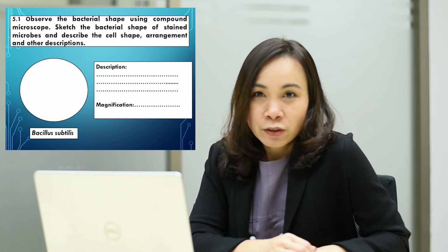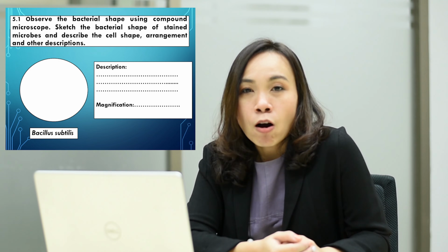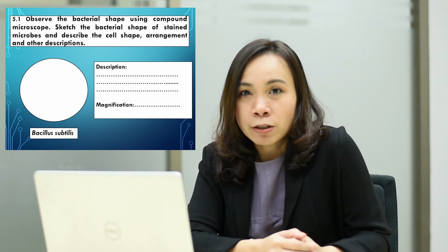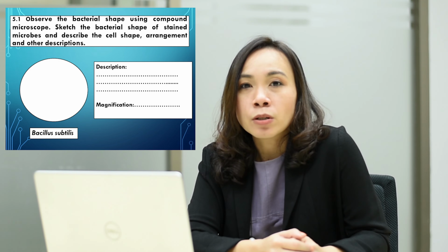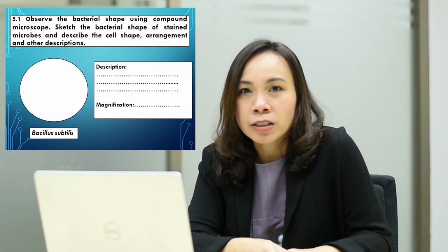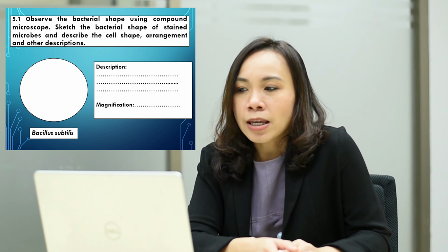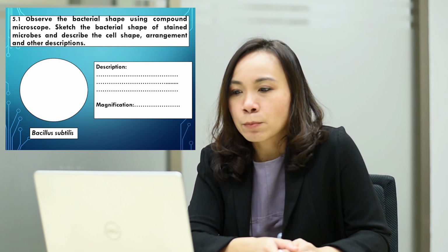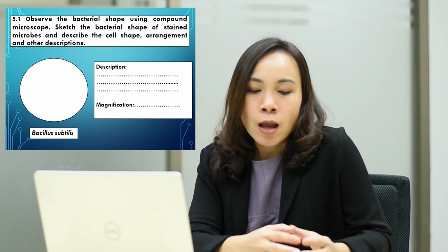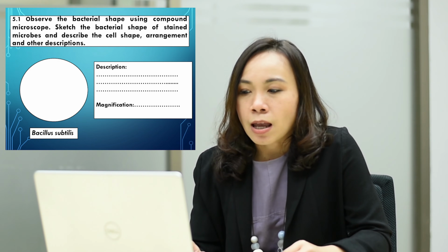After you observe the bacterial shape by using compound microscope, you have to record the bacterial shape, sketch the bacterial shape of the stained microbe or stain of the two bacterial samples. The first one is Bacillus subtilis and the second one is Micrococcus luteus, and see how different, and describe the cell shape, arrangement, and the description.